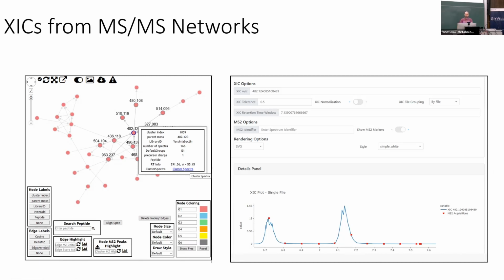So who of you has a problem with that there's 482 as a node, but there's 2 peaks in here? For one XIC, right? Yeah. Different RTs means it's doing something different on the column. Exactly. So they're actually 2 molecules, right? Because they have 2 retention times and they're very nicely separated. It's a perfect baseline separation here.